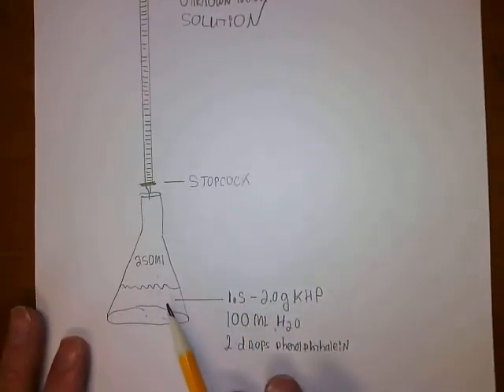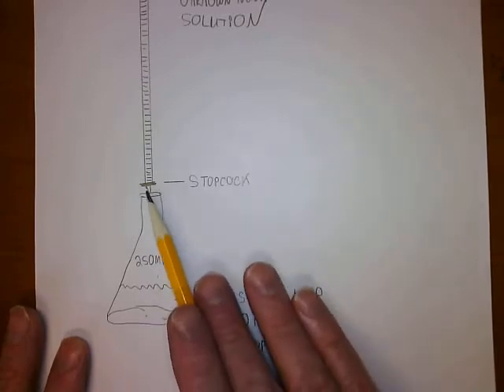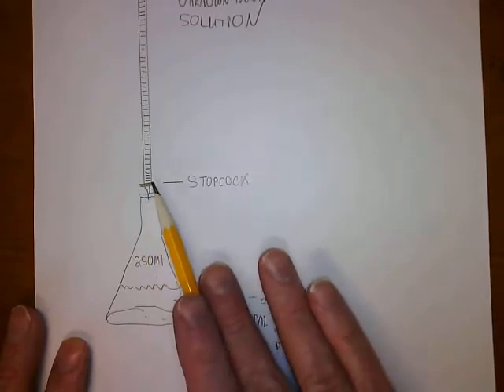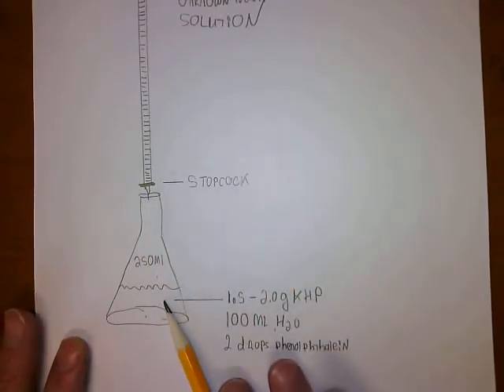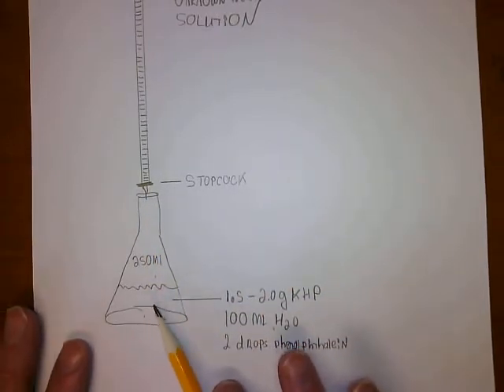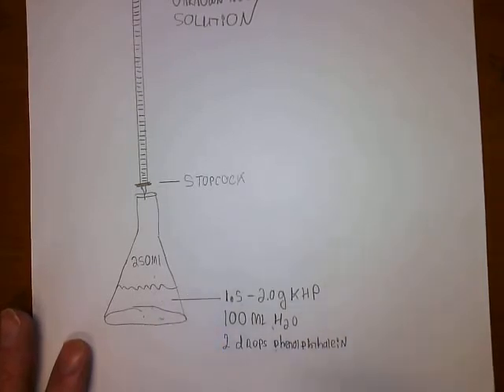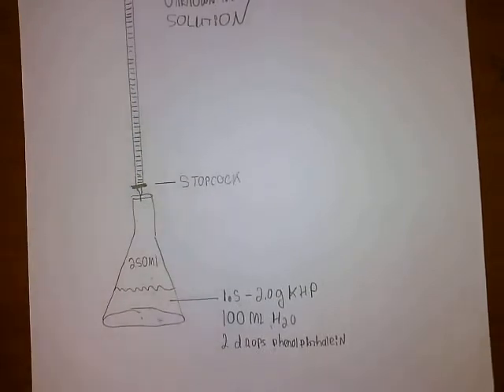Once all the KHP has been used up, the next drop goes in. There's no more KHP for the NaOH to react with. Now there will be an excess of hydroxide in solution, and the indicator will do its thing, and the solution will change from colorless to bright pink, and that's how you know when to stop the titration.